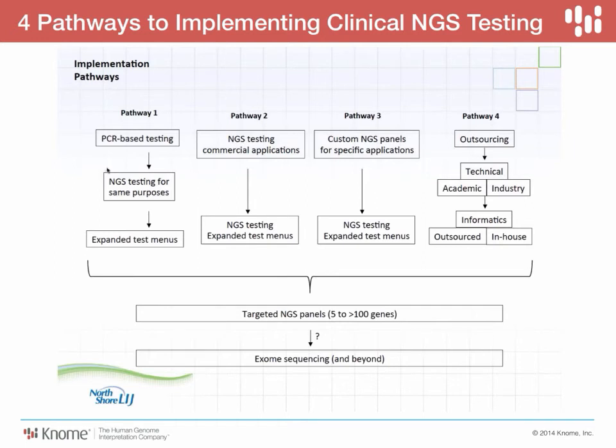So they may have their Sanger assays for a set of genes, these small gene panels, and when they adopt NGS, they're simply updating the technology, but effectively running the same test, taking advantage of their accumulated knowledge about the relevant variants in these genes. Of course, being NGS, they may well expand those lists out a little bit since it doesn't really add to their sequencing costs.